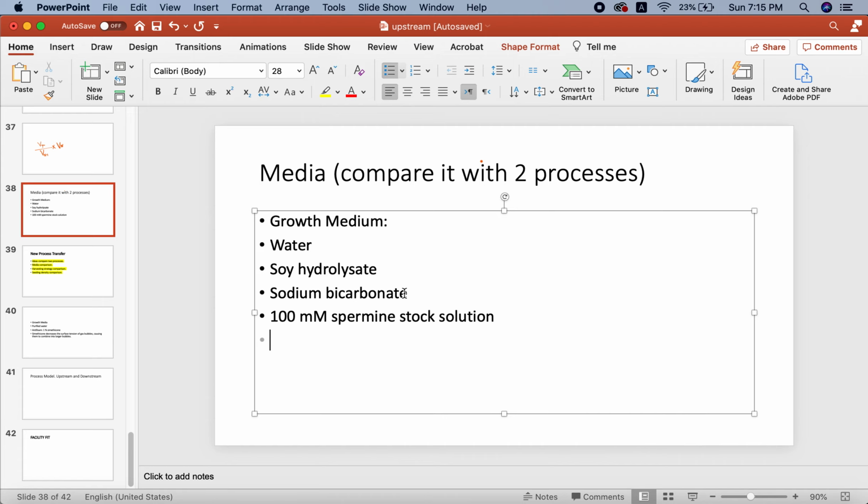Target 30 to 40%, pH 7, O2 sparger type drilled pipe, day 0 to the day prior to VCD reaching 10, 15 micrometer sintered sparger.